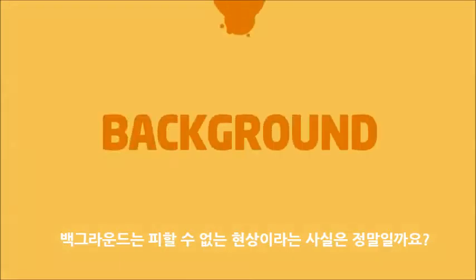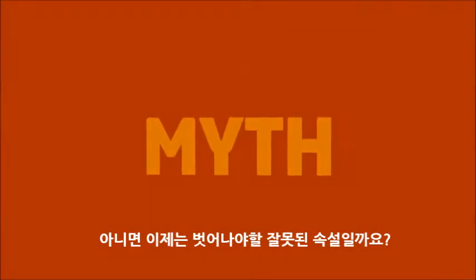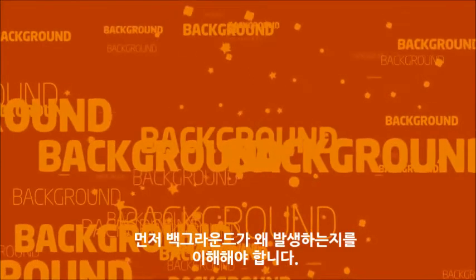It seems to be an established fact that background can't be avoided. Or is this a myth that now ought to be busted? First, we need to understand where background comes from.